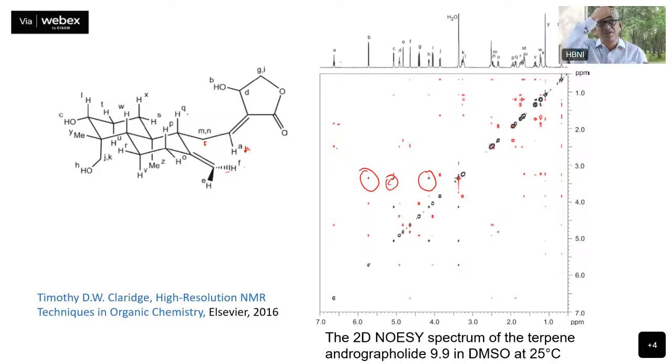Distinctly, you can identify which are the exchange peaks and which are the NOE peaks, and from the NOE peaks, we can calculate the structure of the molecule. A big analysis may be an exercise for the students to analyze all the peaks. Take this molecule and identify, here the assignments are already given.